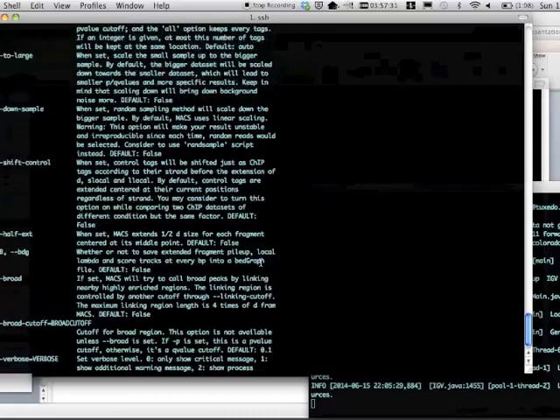By the way, if you're not familiar with this backslash at the end of lines, this means that this is an entire line. It's basically a single line that we're just splitting up into multiple lines for better readability. We can even split it here and add an extra line. This is just to make the code that we put in the script a lot more readable, a lot easier to follow.